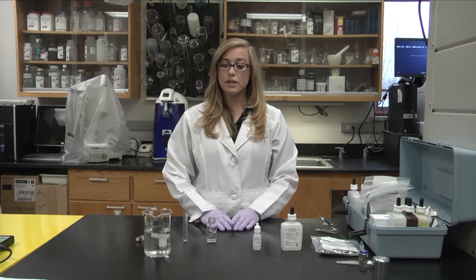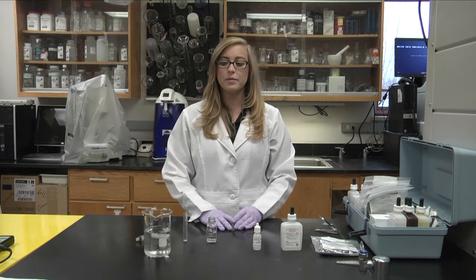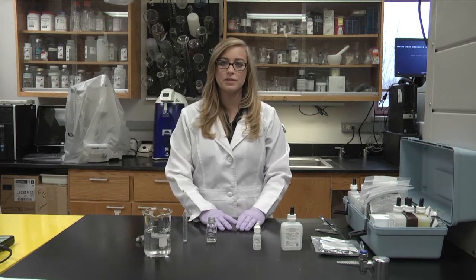Now we're going to test for alkalinity. Alkalinity is the total concentration of bases, and this refers to the capability of water to neutralize acid, or its buffering capacity.